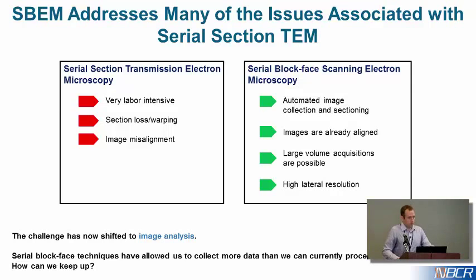So the point of introducing this was, of course, to give everyone an idea of what the images we'll be looking at subsequently are, and then to reiterate the point that a lot of the problems with collecting these data sets are mostly solved at this point. We can get big volumetric EM data sets automatically and pretty painlessly, and the onus is pretty much now on what do we do with them.